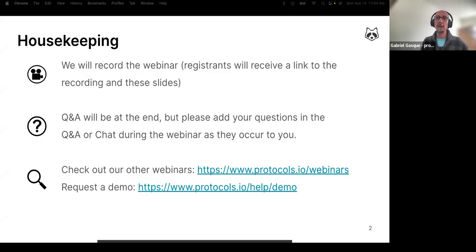Before we jump into the material of the presentation, which will be mostly a live demo, we're going to be working directly on the platform.